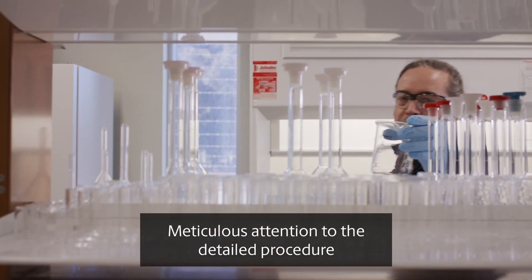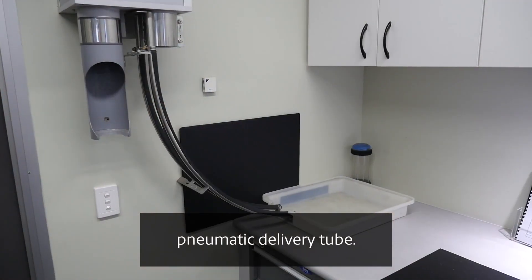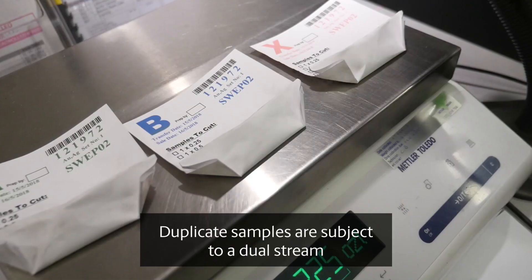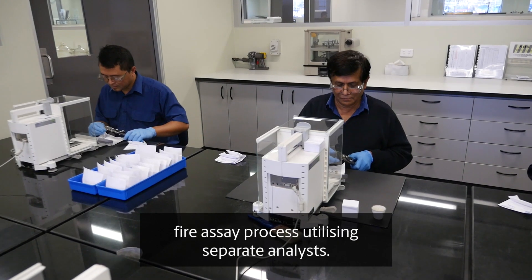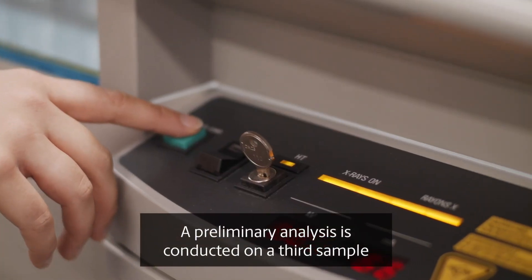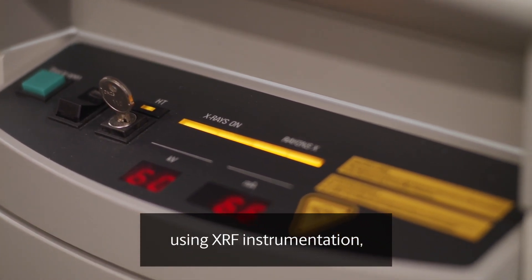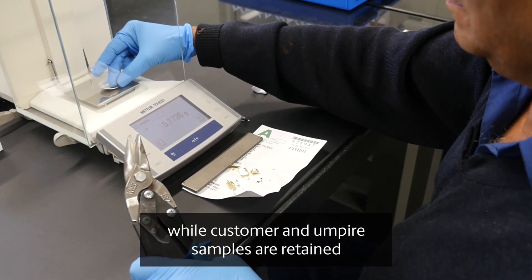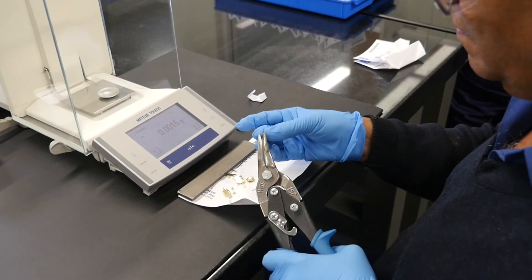Meticulous attention to detailed procedures begins as the immersion dip samples are received by pneumatic delivery tube. Duplicate samples are subject to a dual stream fire assay process utilising separate analysts. A preliminary analysis is conducted on a third sample using XRF instrumentation, while customer and umpire samples are retained for independent customer or third party analysis.